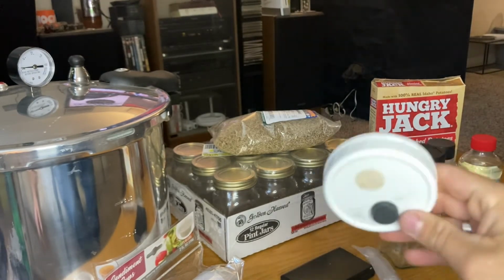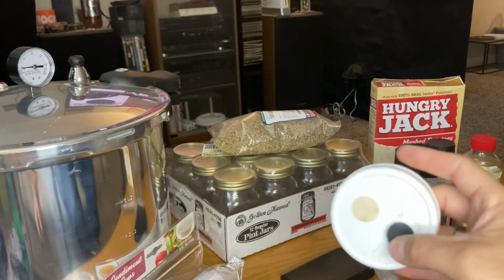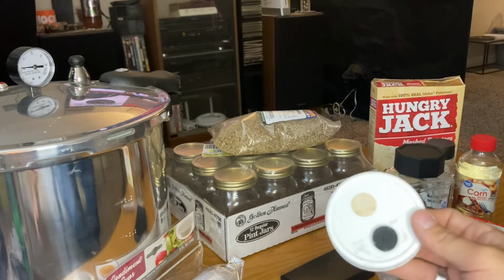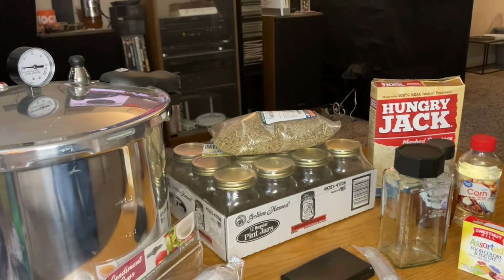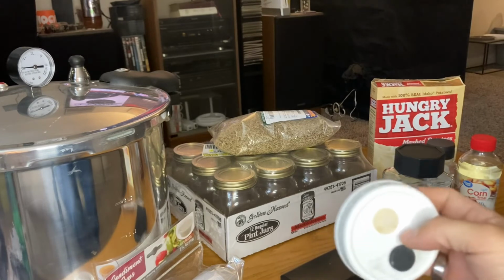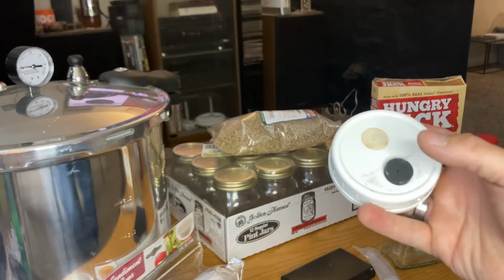This lid is very old and not going to be reused, but I just wanted to bring it out to show you guys what they look like. And you can find those, packages with both of them in there for $10 or less. And you just simply drill a hole into the mason jar lids and then attach that, wipe it down with some alcohol, make sure it dries, stick that on there, stick this one on there.